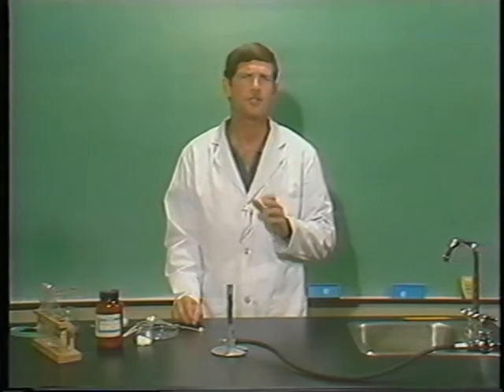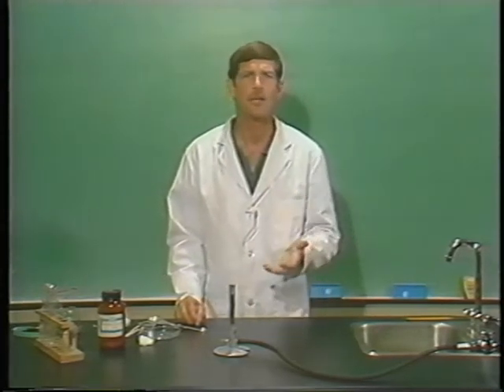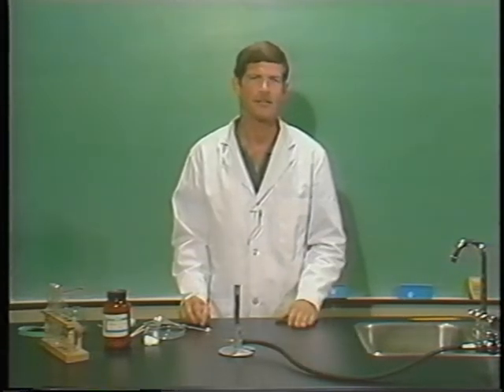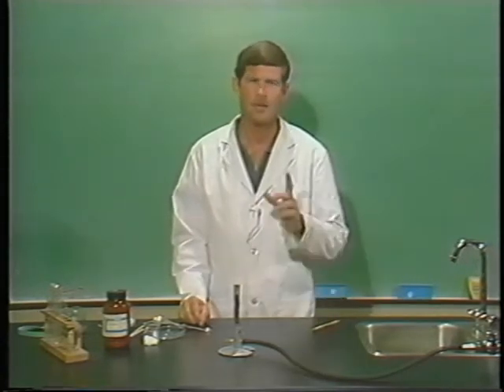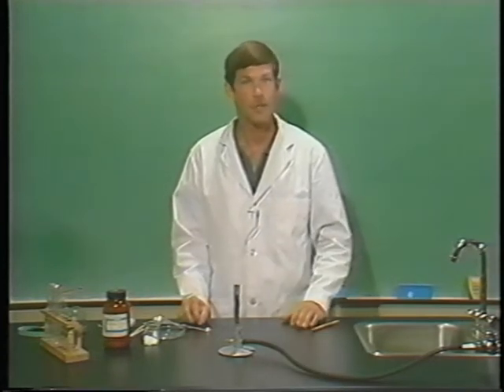Now, one of the most dangerous things to do is an unauthorized experiment. That's where you're experimenting on your own without following directions. Your teacher's not going to like that. Even something kind of harmless, like burning a pencil over the Bunsen burner, would be an unauthorized experiment. Let's take a look at this unauthorized experiment and see just how dangerous some of them might be.